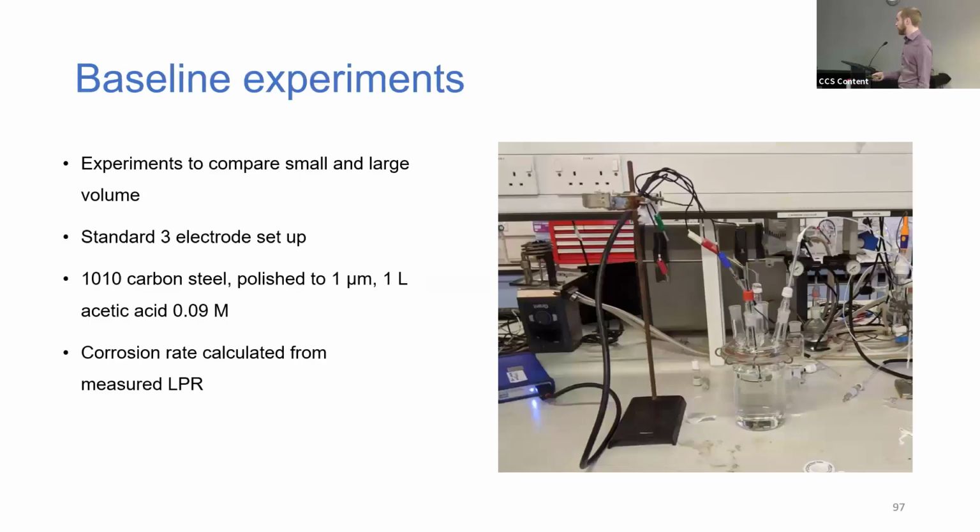For this experiment, we just used a 3 electrode setup, same substrate, same solution, and corrosion rate, LPR, was measured and corrosion rate calculated from that. And this is our setup on the right. It's just a glass cell, liquid in it, electrodes in, nothing special.